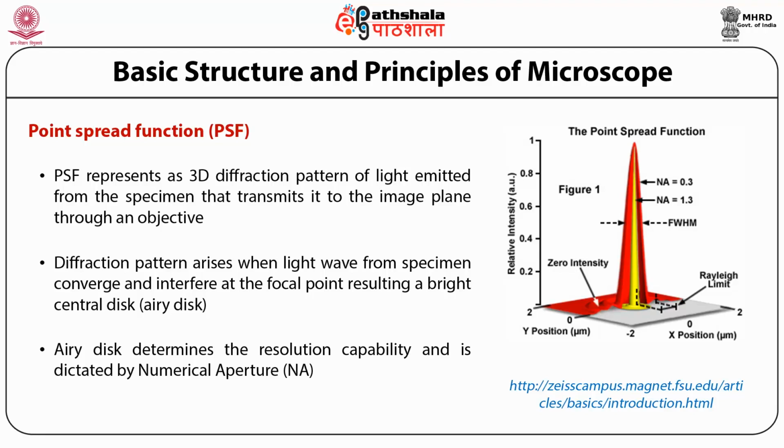for a single object, when light is emitted by a single dot. This also depends upon the numerical aperture. If you have a good numerical aperture, then you can concentrate back your signal intensity to the Airy disk and get a better resolution.